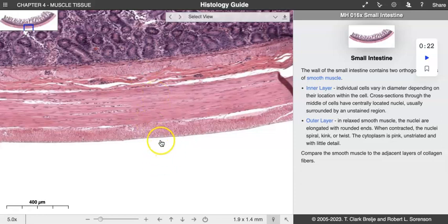Just come out way to the periphery, and you're going to see a section that, typically when we cut this for your slides, is going to look like a cross-sectional view. And then here are some longitudinal fibers. Your slides might be reversed or flipped, and this might be cross-section and this might be longitudinal, because of how they cut your intestine.